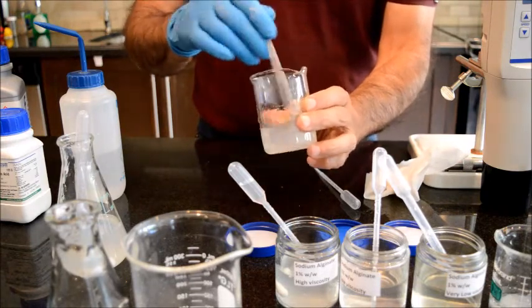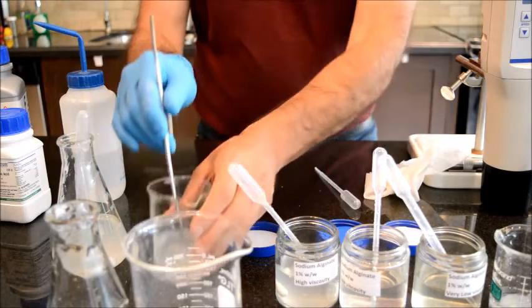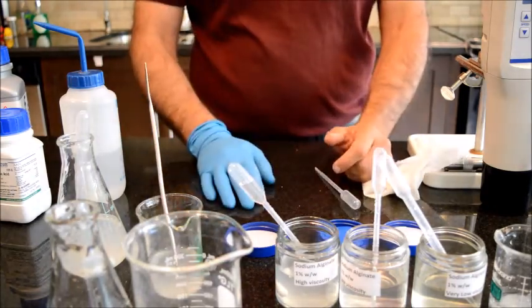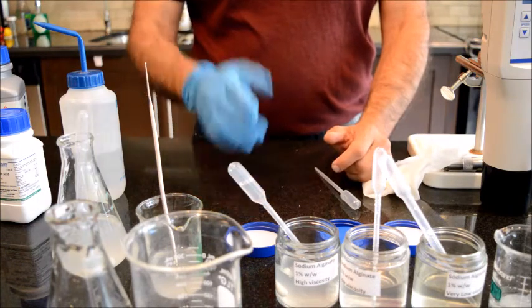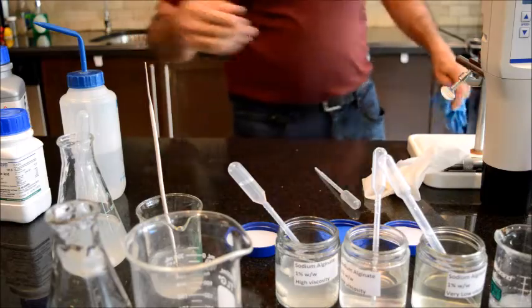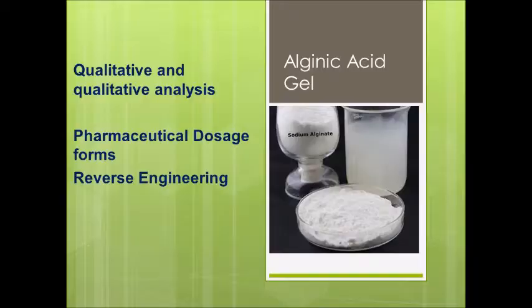So let me show you a few slides that explain a little bit of the chemistry of what is happening here. Okay, I will go back and show you some slides. Okay, so I'm going to talk about the qualitative and quantitative analysis of alginic acid in cosmetic products.